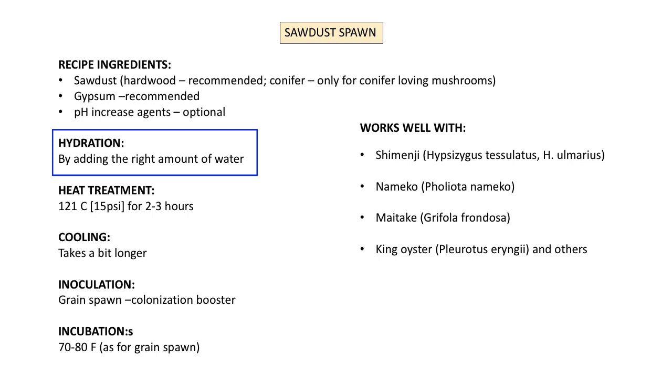We simply add water to the substrate, but we need to be careful on how much water you are going to add to that. Using too much water will slow down mycelial growth and encourage bacterial formations, so we need to make sure that the substrate humidity rate will be somewhere between 50-65%.